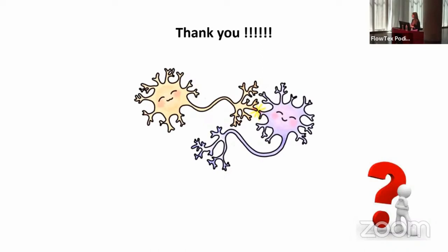In this case, it is Sigma Millipore. I don't see any problem with that, but as for now, it's not available. It would be great because we'd cut a little bit of time during incubation, so we'd shorten the procedure time, but as for now, it's not available.